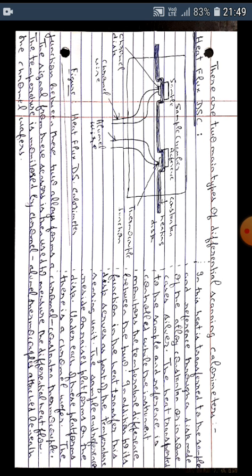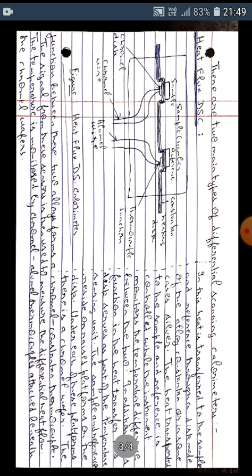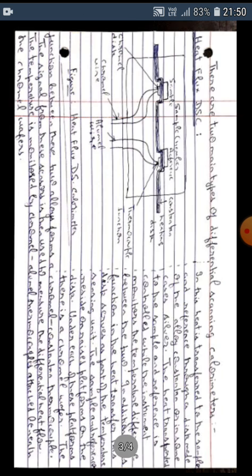Under each of these platforms, there is a chromel wafer. The junction between these two alloys forms a chromel-constantan thermocouple. The signal from these sensors is then used to measure differential heat flow. The temperature is monitored by chromel-alumel thermocouples attached beneath the chromel wafers.